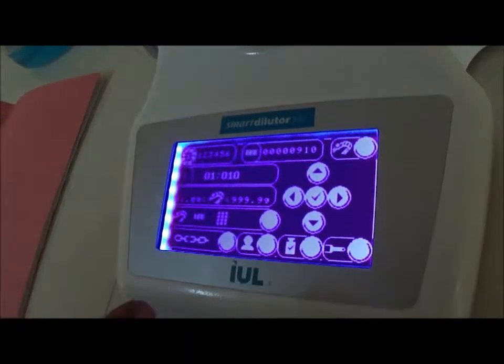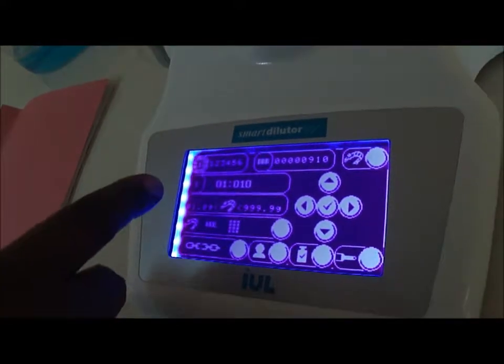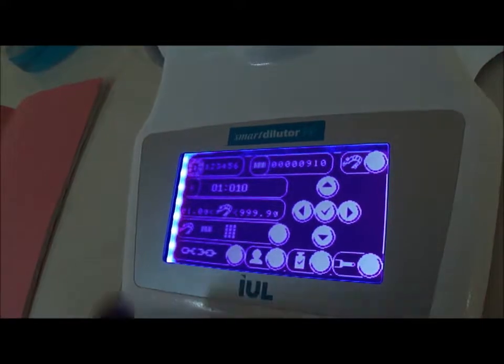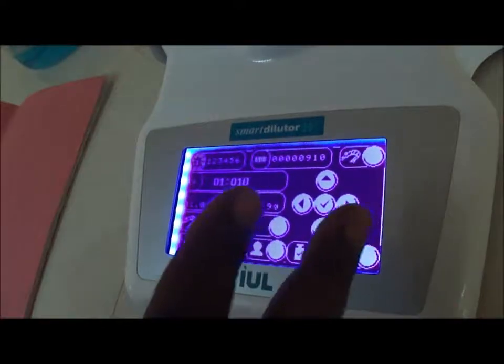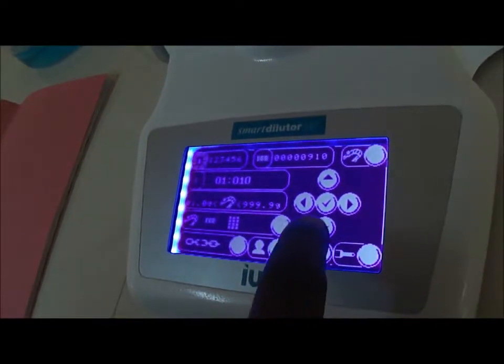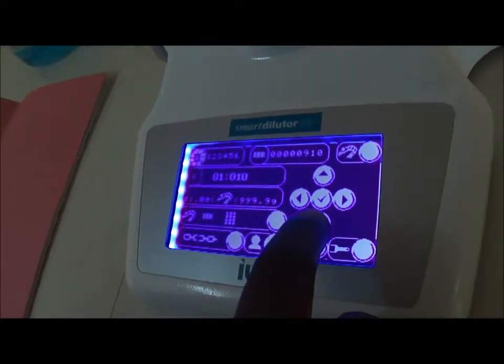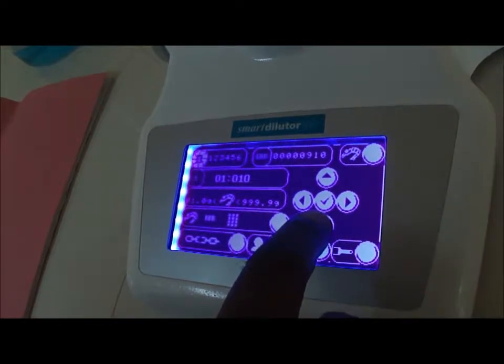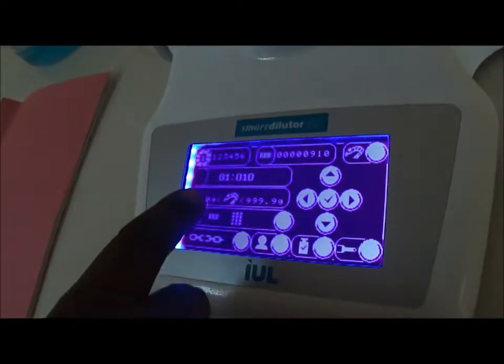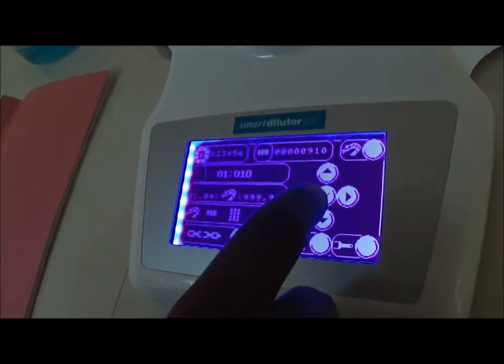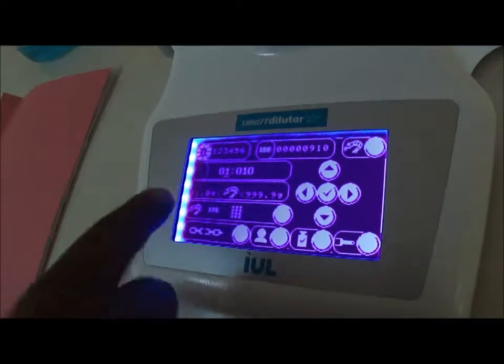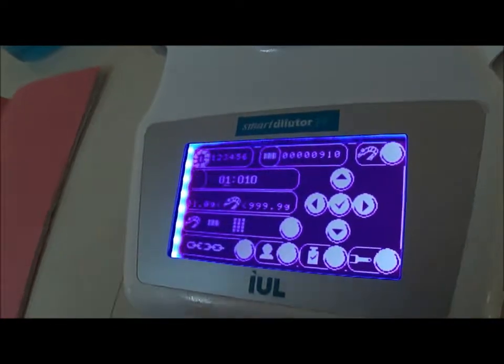And then you enter a submenu here, where still you can change the pump number. You have two pumps only. And the dilution factor also, by just pushing these small triangles. You can move in between the fields. And the dilution factor, you can change here, by pressing on the small V. And then, I have chosen here a dilution factor of 1 over 10.